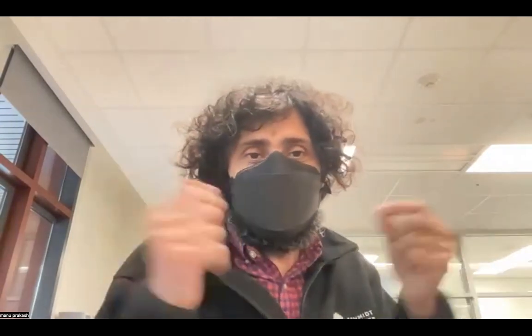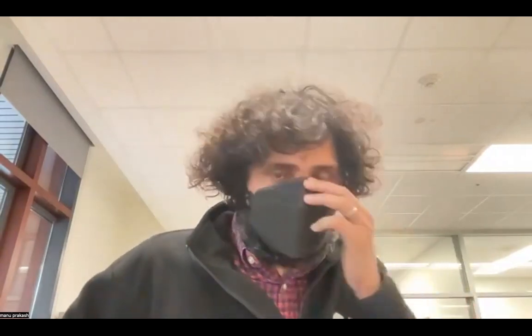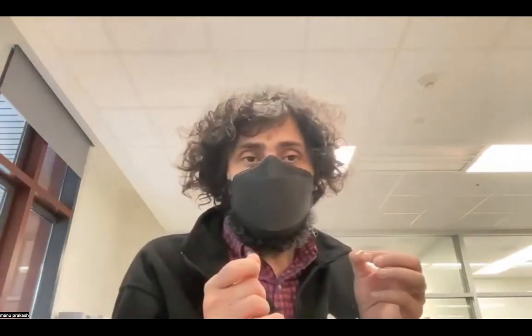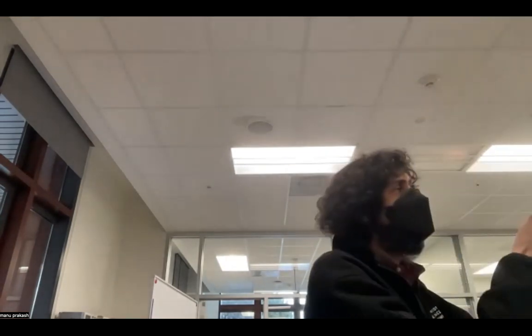And then for the folks that are online, one thing I would love for you all to do is find a button and a few strings and try getting the toy working in your own hands. It can be a piece of cardboard, it can be a paper, as long as it doesn't tear. And I'll show you what we use when we make paperfuges. The paper is actually tear-proof.